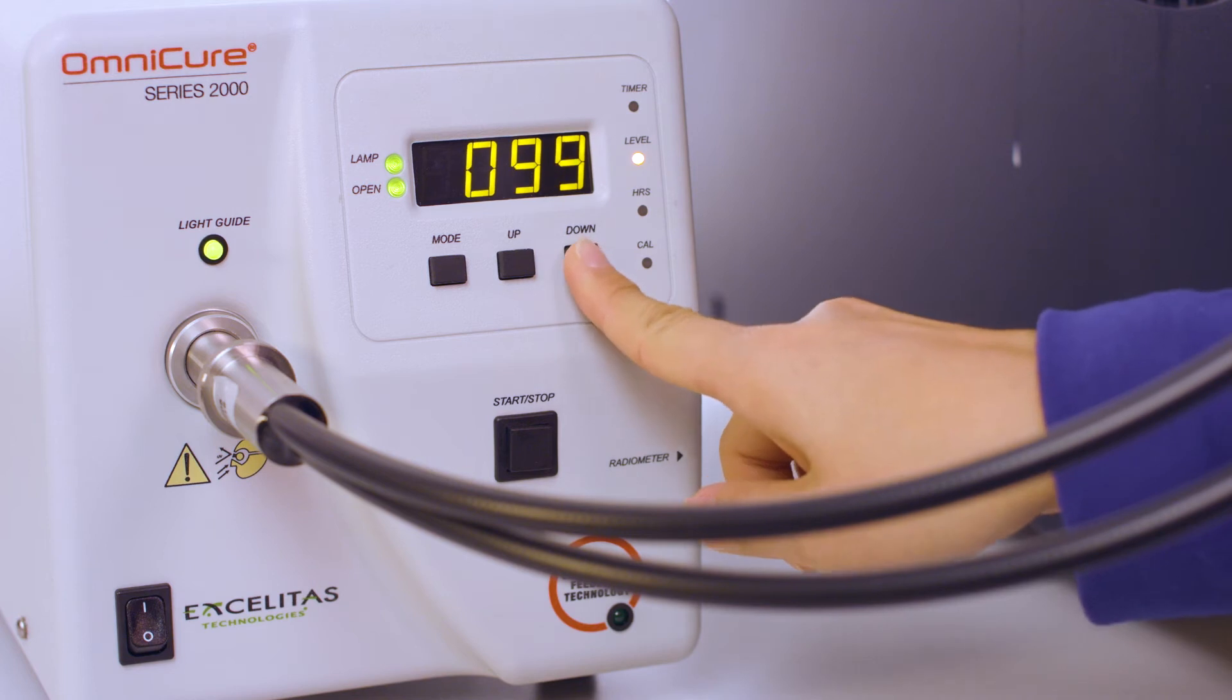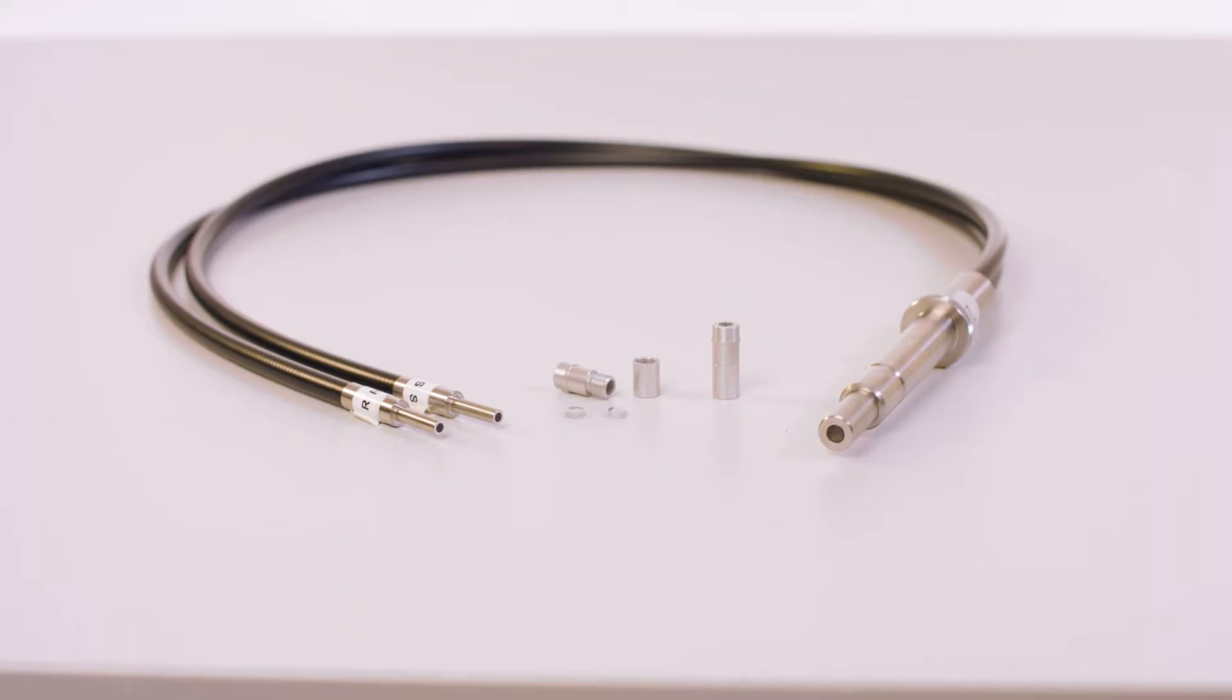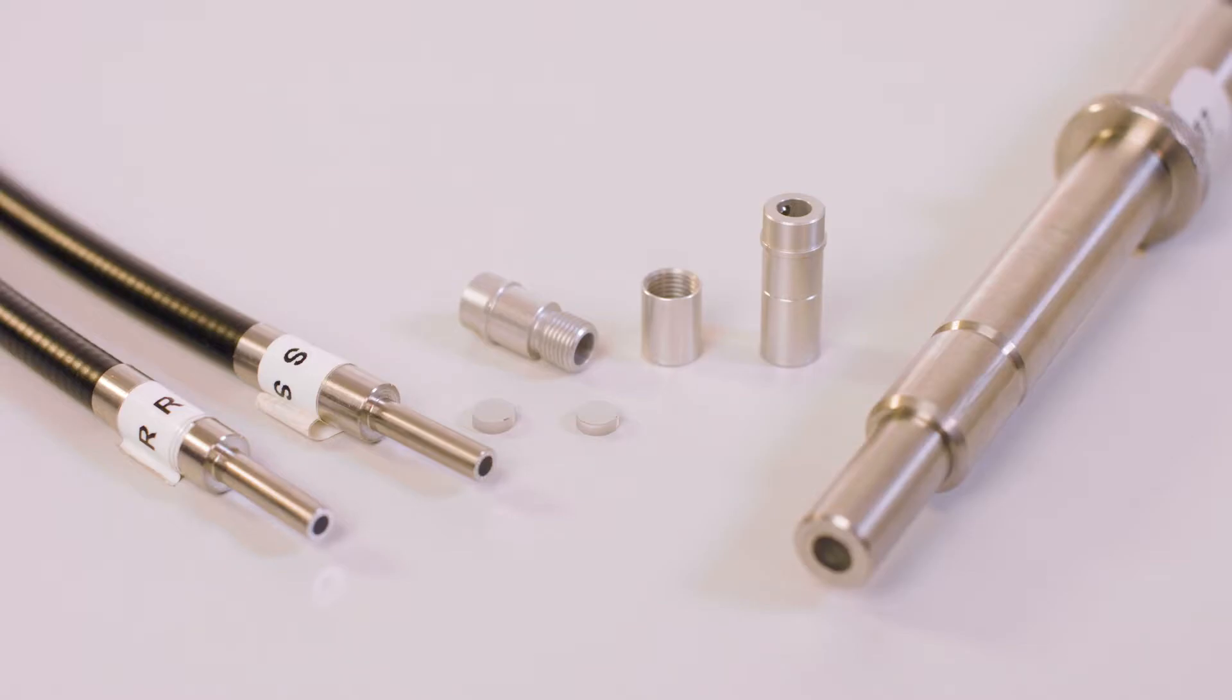The intensity reaching the DSC cell is adjusted using a combination of aperture control at the PCA unit and neutral density and/or cutoff filter at the end of the light guide.